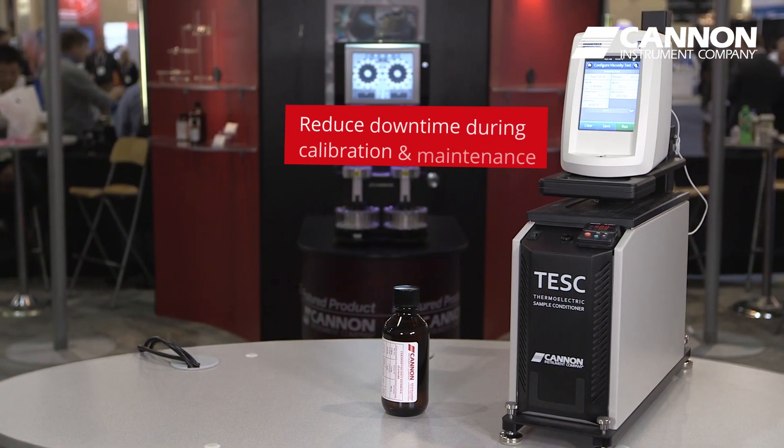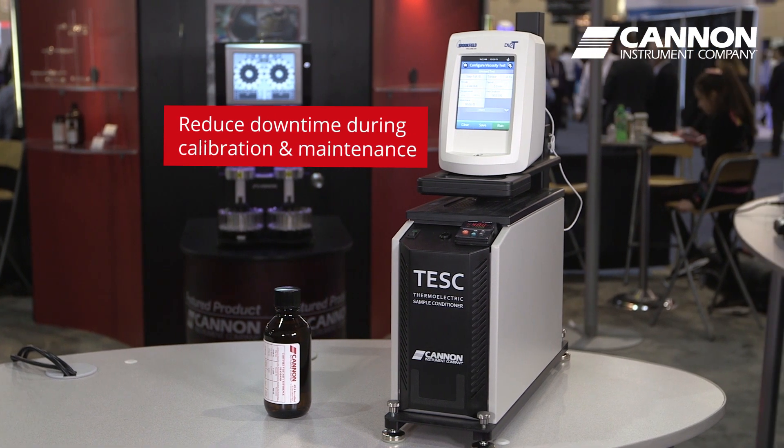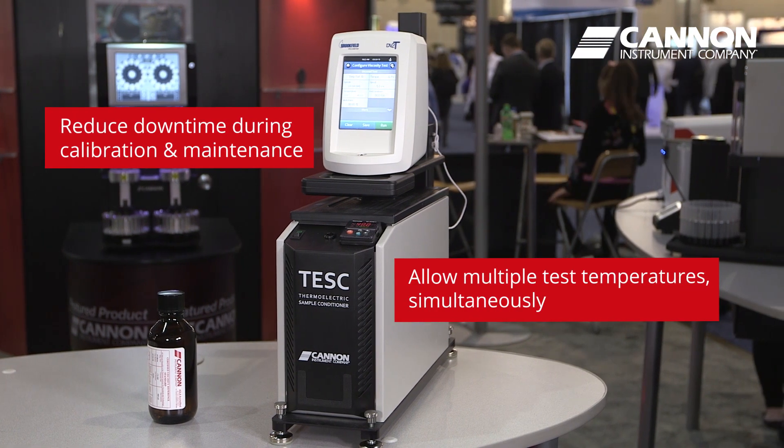This added redundancy reduces laboratory downtime should an individual instrument need to be calibrated or require maintenance. It also allows multiple test temperatures to be run simultaneously.